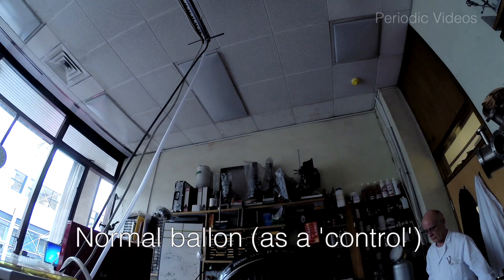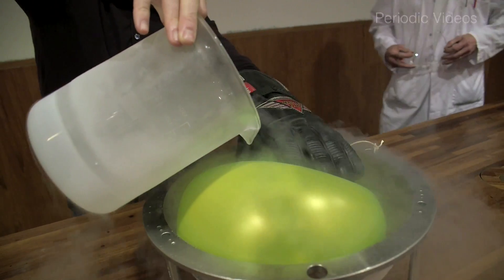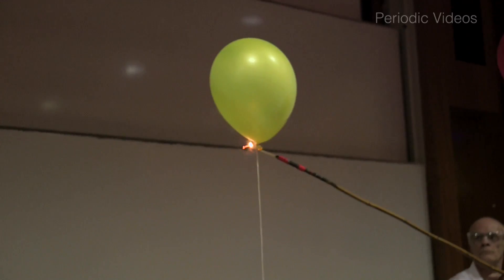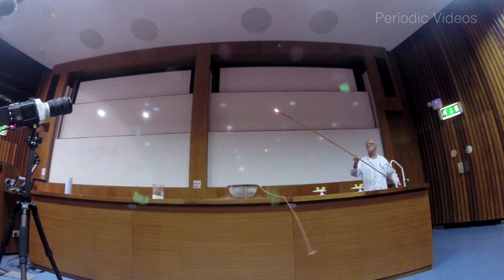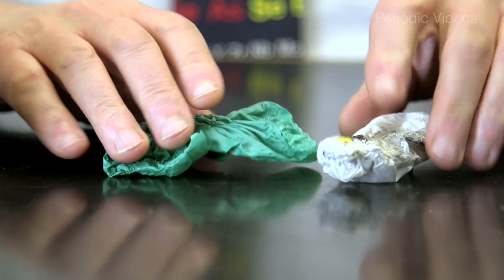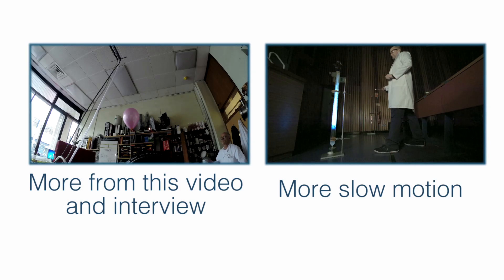So it would appear that this rather strange experiment with a balloon and liquid nitrogen was a combination of two effects. The balloon didn't burst so quickly, and the hydrogen didn't mix with the air as well because its pressure was lower. But what was quite interesting is that rather than the balloon — where little bits disappear across the room and you rarely find them — we ended up with two quite artistic pieces of burnt plastic, and they're quite hard. It makes quite a bang. I'm sure you've all been at children's parties where the little children burst into tears when the balloon bursts because of the noise.